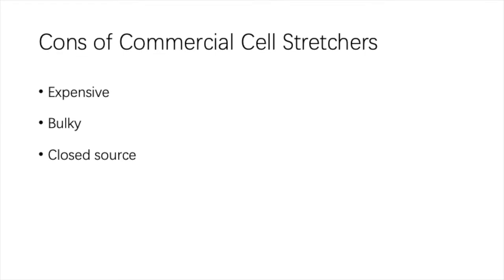With all these commercial stretchers, there is a high cost for the device and cell chamber. In addition, bulky equipment limits its integration with other devices such as microscopes. Finally, the closed source software cannot be modified to meet user needs.